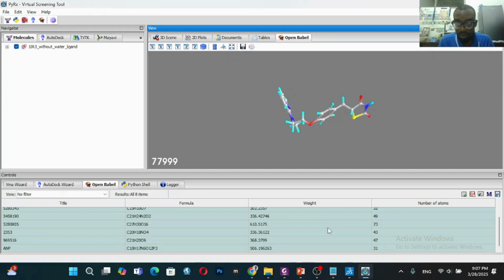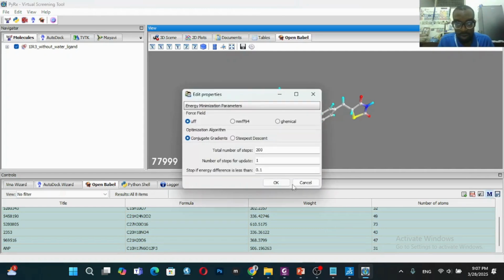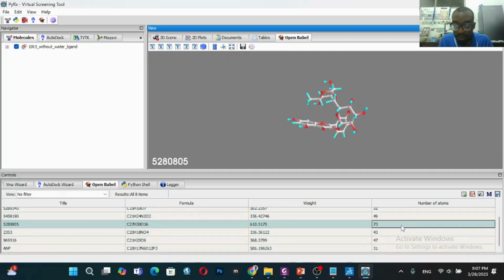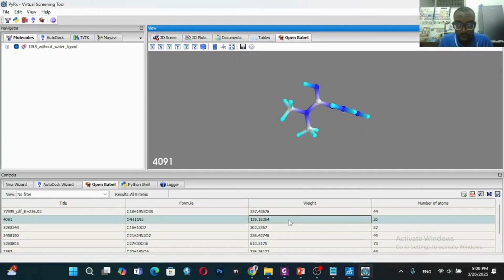So we want to minimize using any of these. Okay, I think it has to be done one by one.